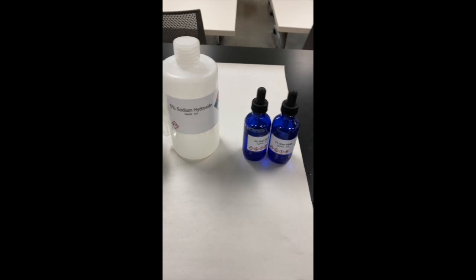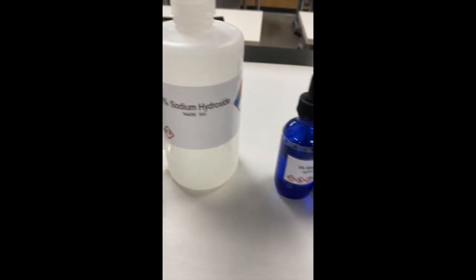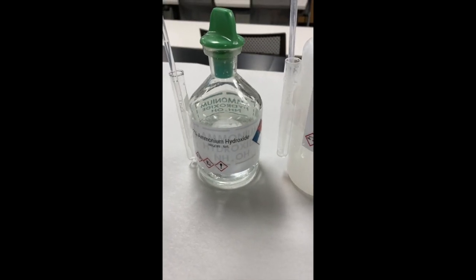We're testing aldehyde and ketone reactions. First I'm going to make the Tollens reagent using silver nitrate, sodium hydroxide, then ammonium hydroxide.